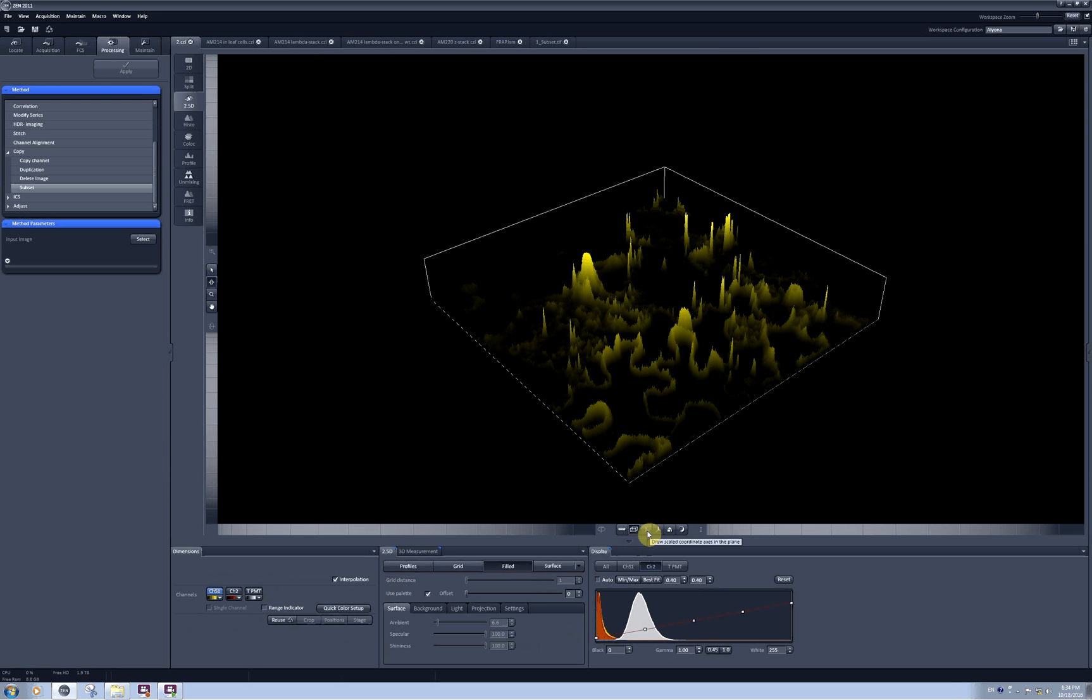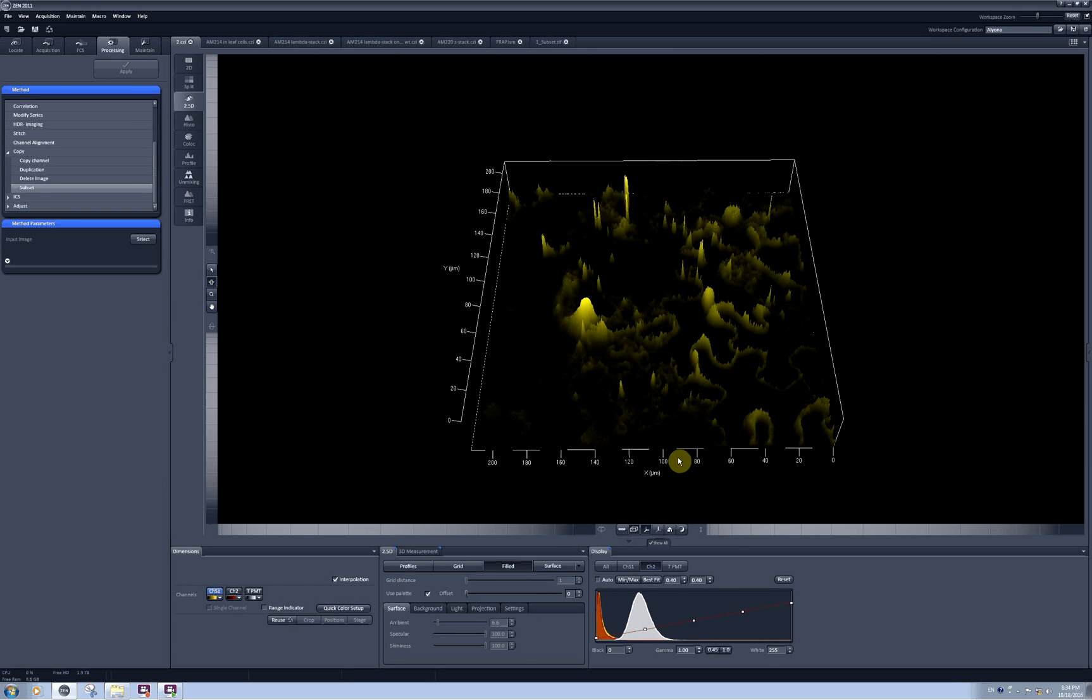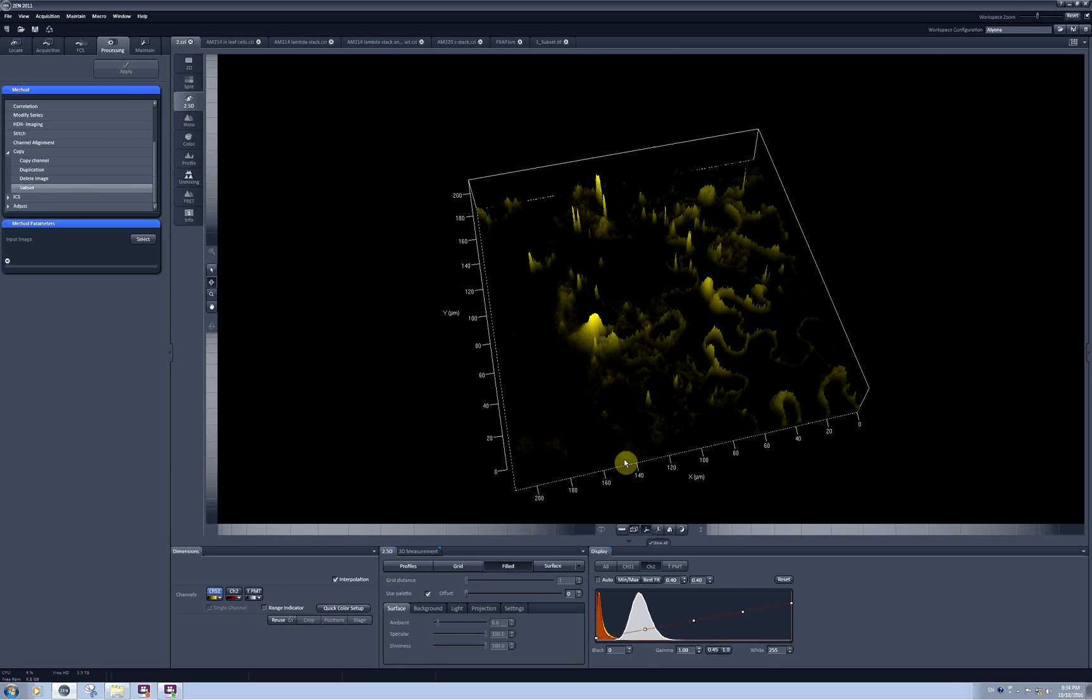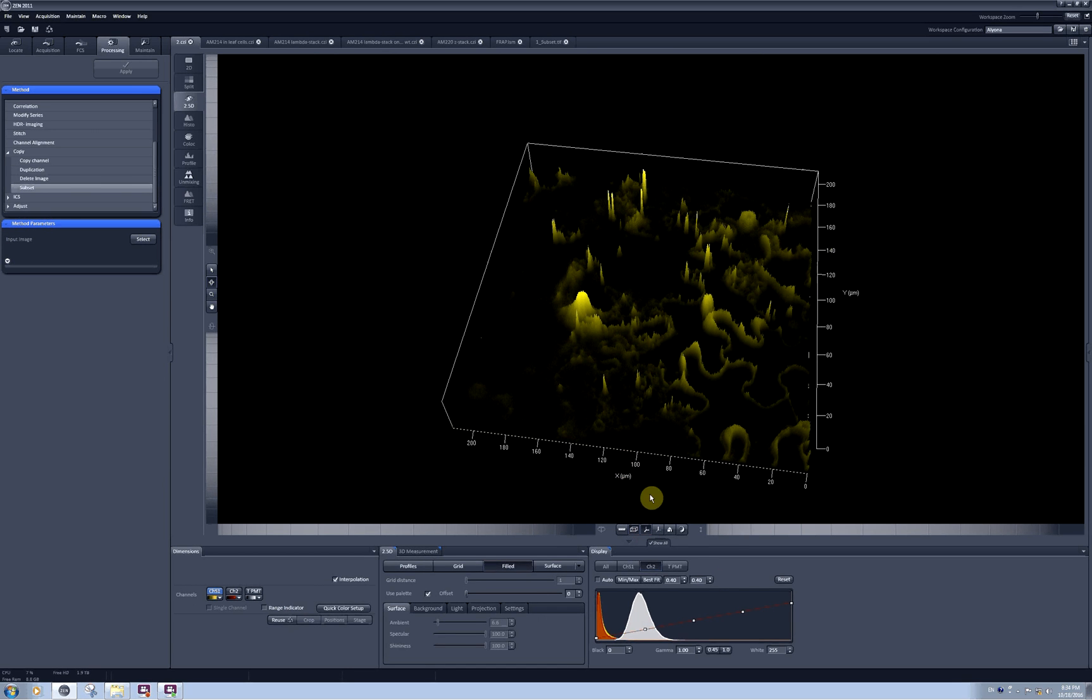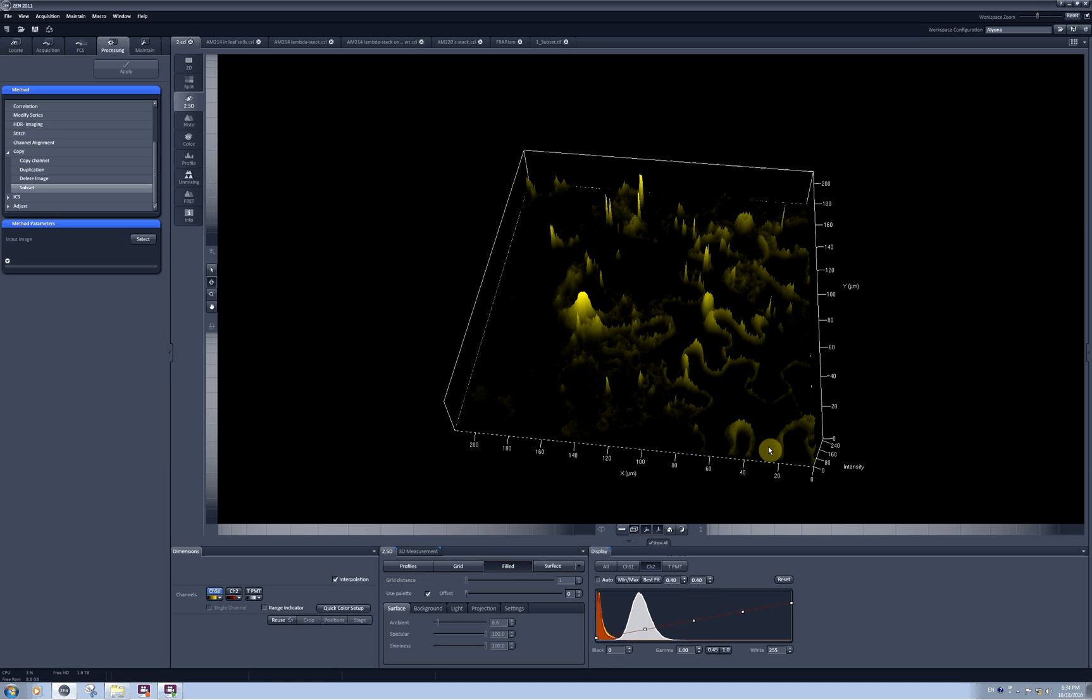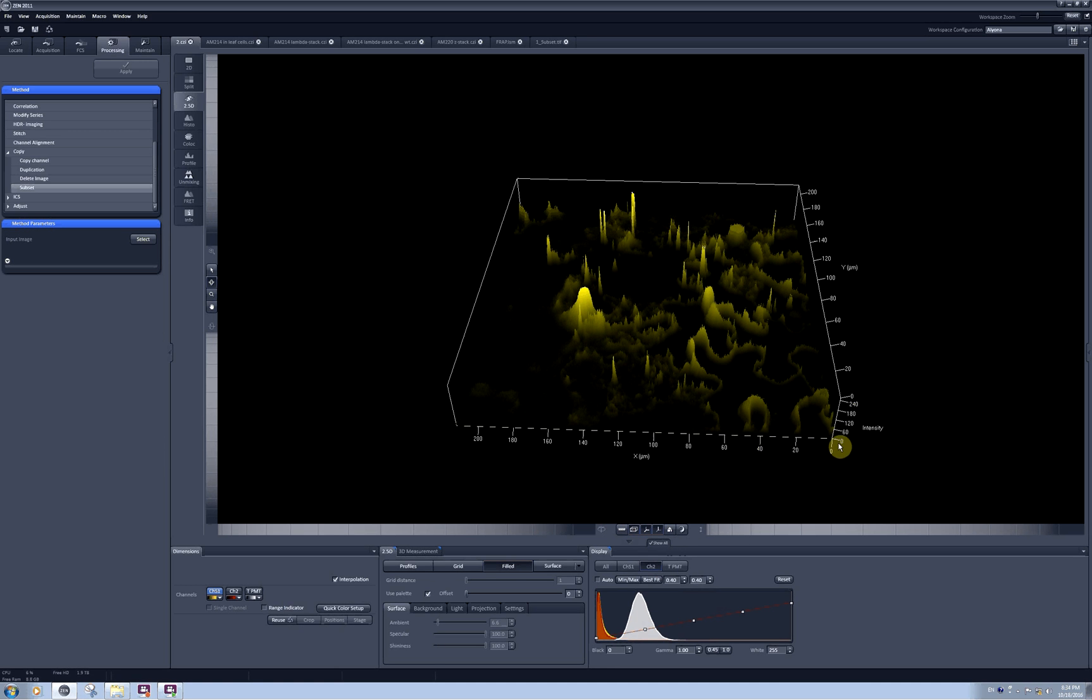You can ask to visualize the xy-axis, so now you can see which one is which. And also a z-axis, which in this case will be intensities plotted from 0 to 255 since I have an 8-bit image.